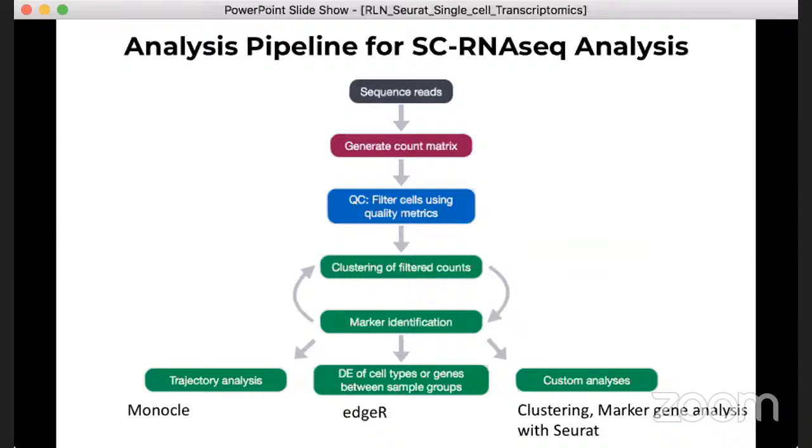Some of the major steps involved in this pipeline include quality control, which will select good quality cells and genes that express high variability, or genes that are expressed with high variance. These selection or quality control steps are very crucial for the clustering process, and also for marker gene identification that will characterize the clusters and hence help us in annotating these clusters to specific cell types.